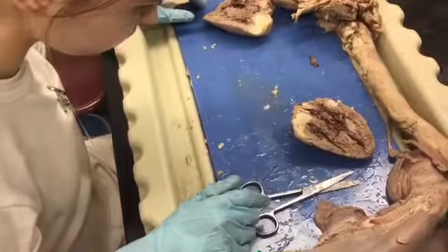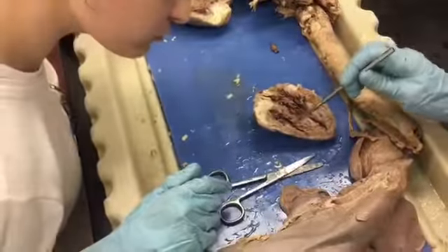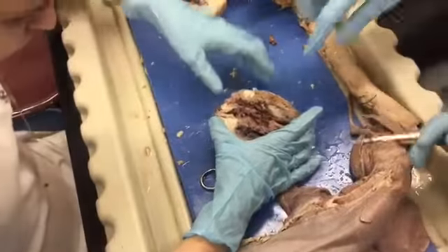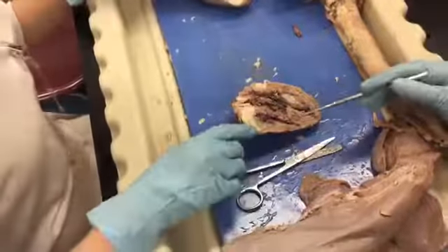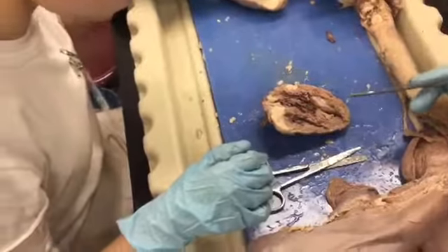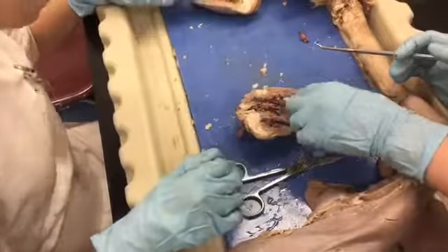So, right here is one ventricle and here's the other ventricle. So, Chris, you said that's the left. Why do you think that's the left? Because this side is thicker. Yeah, so your right ventricle only has to pump blood to the lungs, which are right there, so it doesn't have to work very hard. Whereas the left ventricle has to pump it to the entire body, so it has to be a lot stronger because it has to do a lot more work.